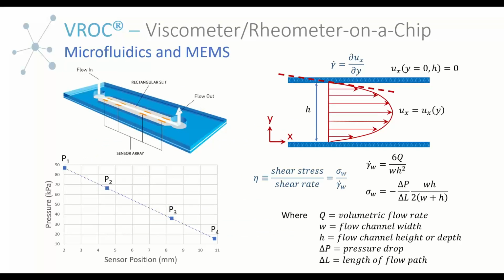As I mentioned, we're going to remind you about the calculation of the viscosity, and we're going to do everything today specific to our VROC technology. However, there are analogous calculations, equations and dimensionless groups that would apply to, say, rotational instruments. I'll point out some directions if you don't use our technology, but rather use rotational rheometers.